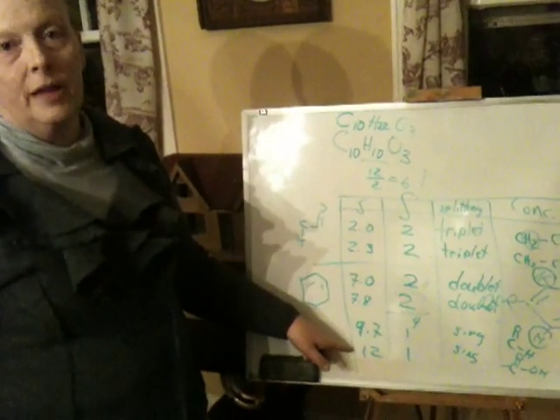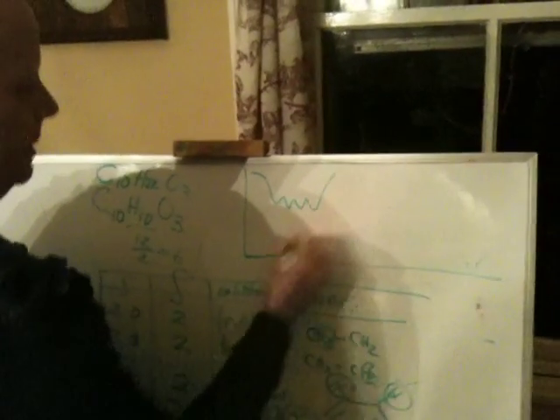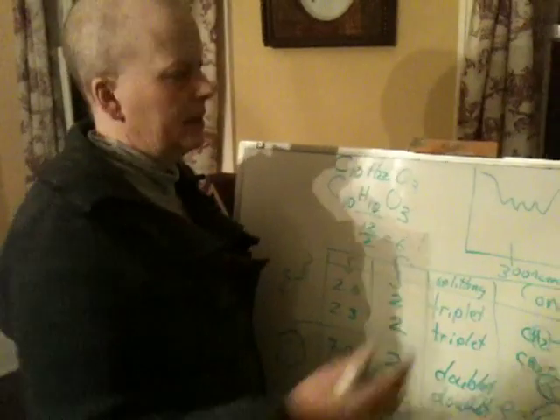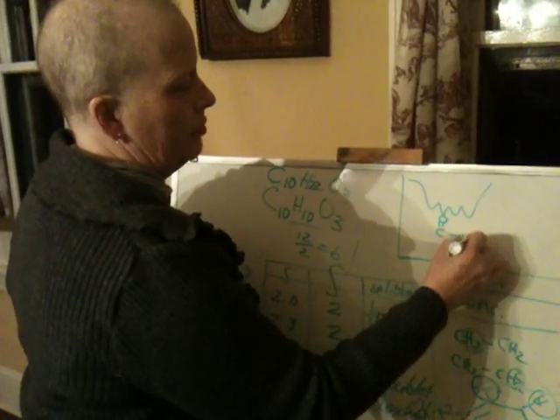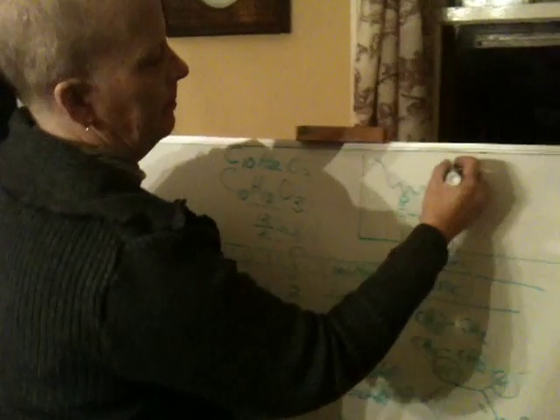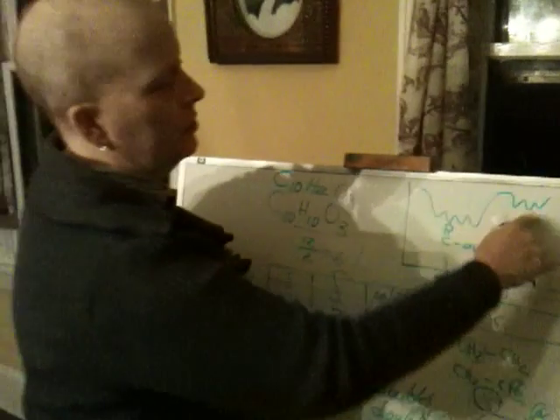Carboxylic acid, sure thing. Now go back to the IR and realize the IR had a very broad peak centered around 3,000. And I don't know if you remember this from the landscapes or the topographies we did in class. This corresponds to the OH of a carboxylic acid, which has sort of a unique landscape. And then there were a couple teeth here which were consistent with aromatic overtones.